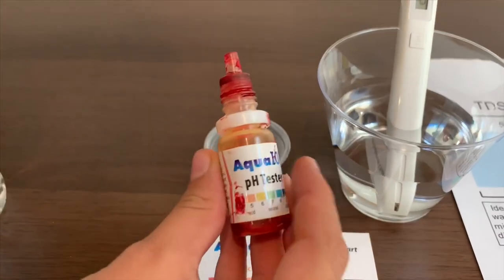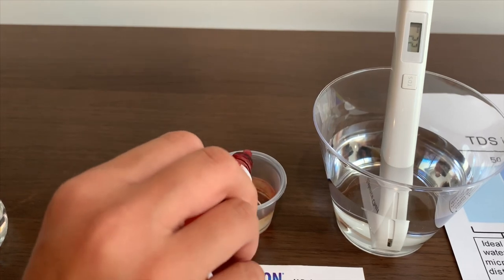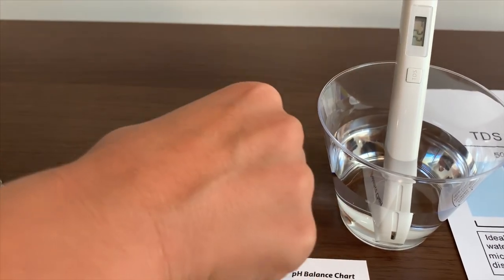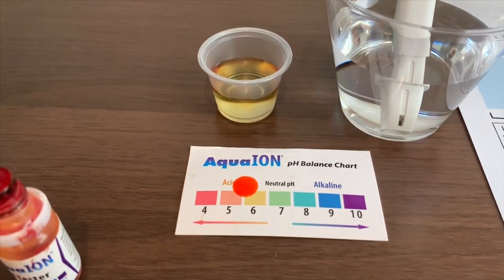Now let's test the pH level. Two drops only. It's number six. That is really acidic.